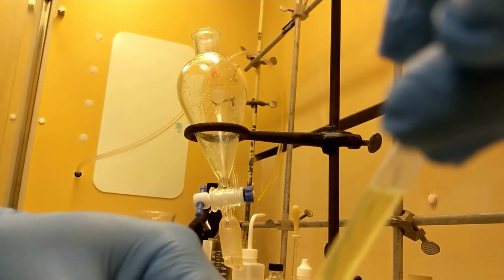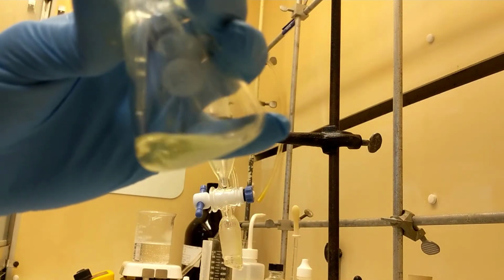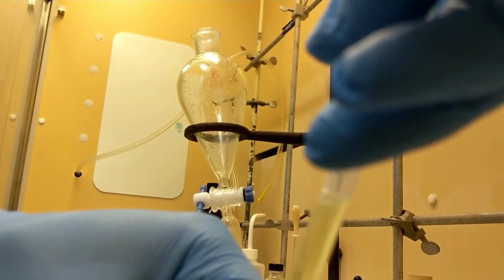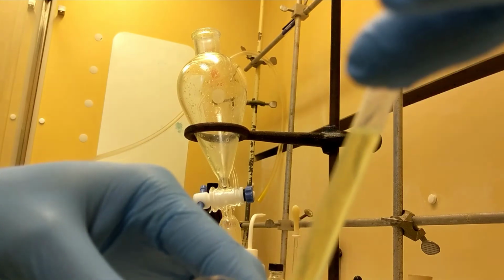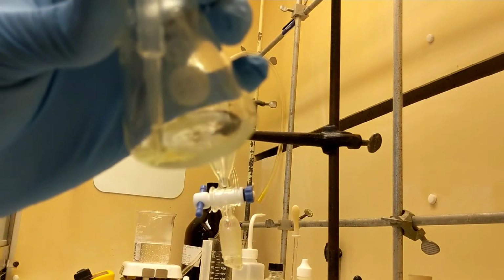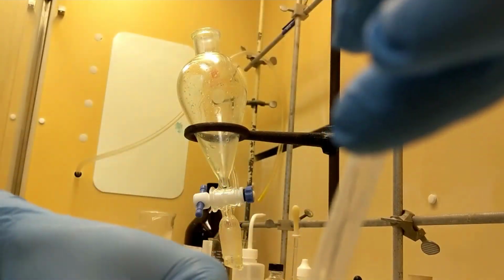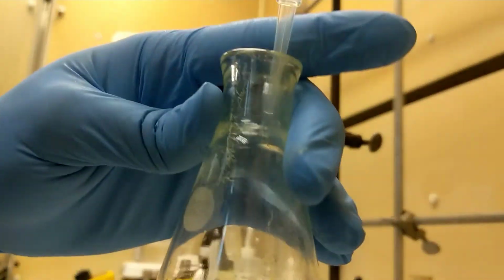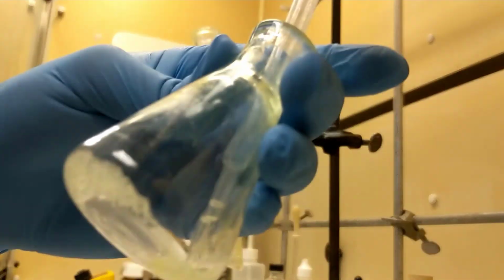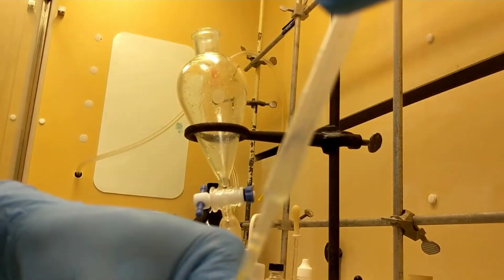Yep, suction off ether. And you might be able to tell it looks like less ether than we started with, which is fair because ether, if you remember, is highly, highly volatile. So the ether has been evaporating off as we've been doing this, which means it should be pretty easy to evaporate off in our final step. So suction that in, and it looks like maybe there's a little liquid back there. I'll go ahead and grab it. You see it back there? I'll go ahead and grab that.